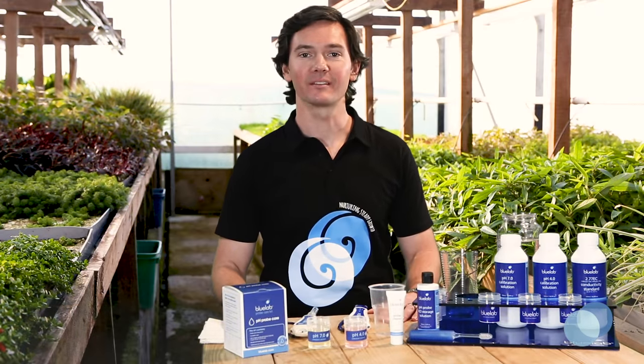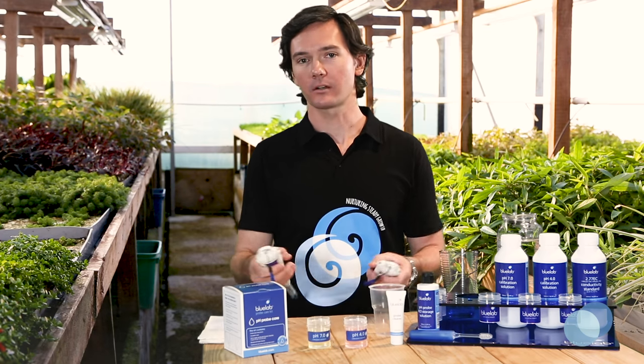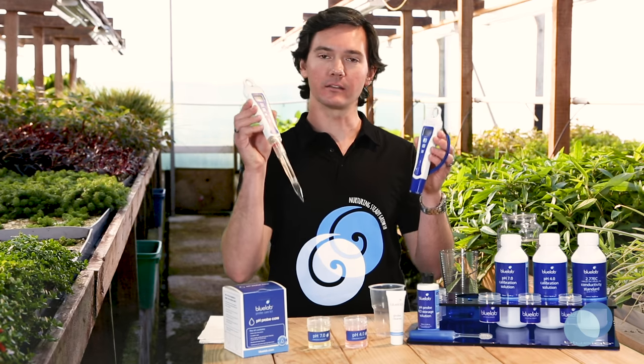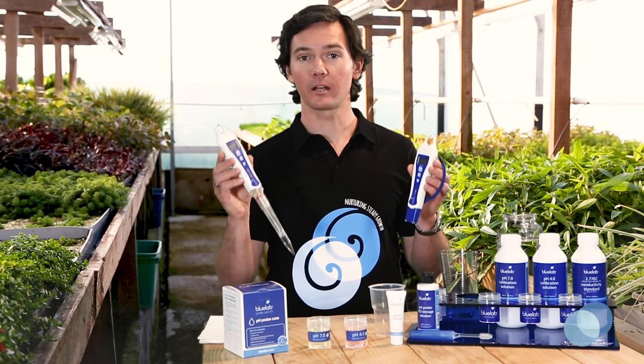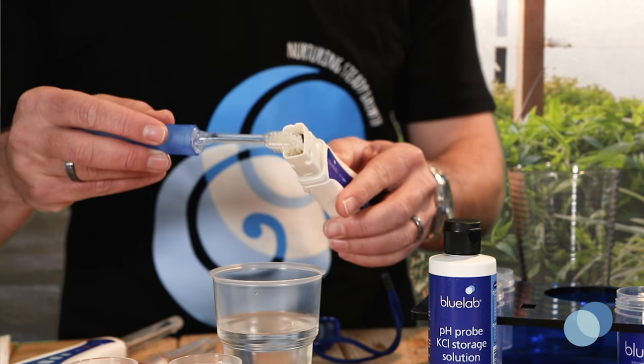I'm Matt from Bluelab, and today we'll be showing you how to clean and calibrate your Bluelab pH pen. In this product range, we have the standard pH pen and the soil pH pen. Now, it doesn't matter which pen you have, as they calibrate in the same way, but there are a few subtle differences in cleaning, which we'll show you.